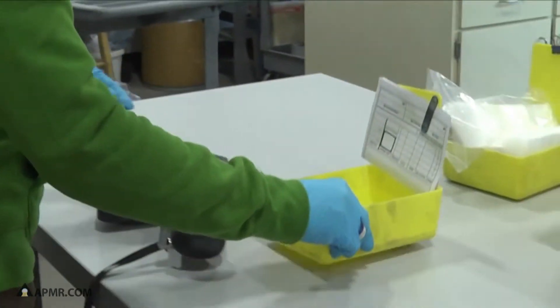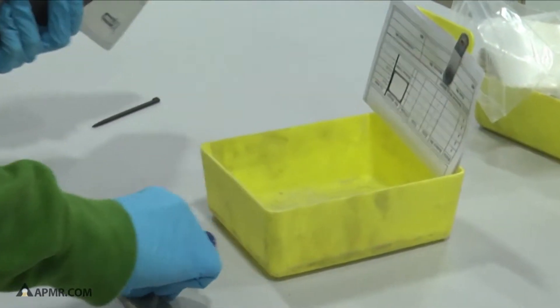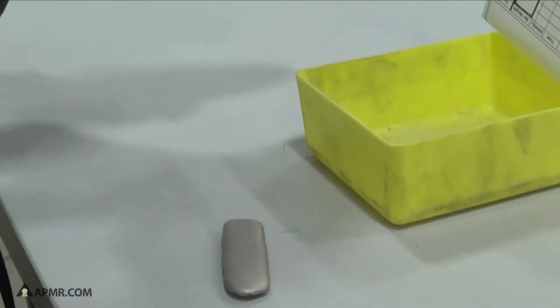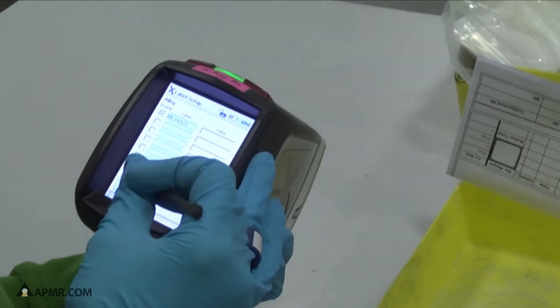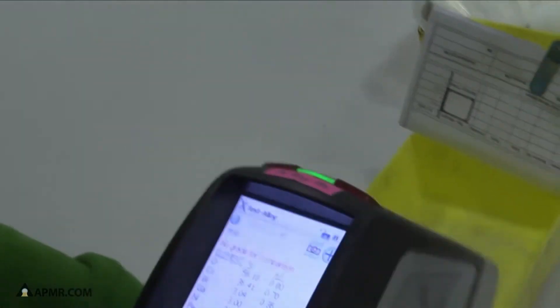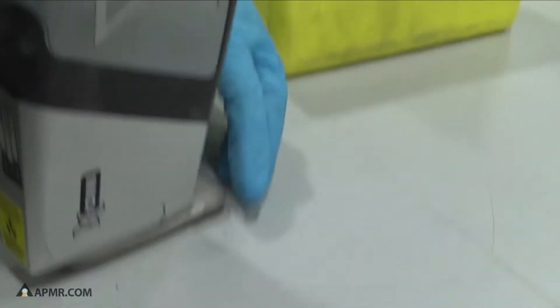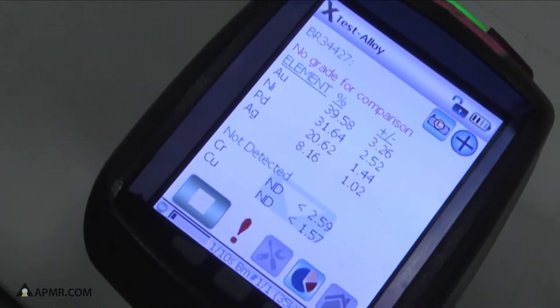This is an example of our preliminary testing or analysis of the content and makeup that we do on every single scrap lot that we process here. This is an X-ray fluorescence instrument that examines the makeup of the metal by using X-rays.